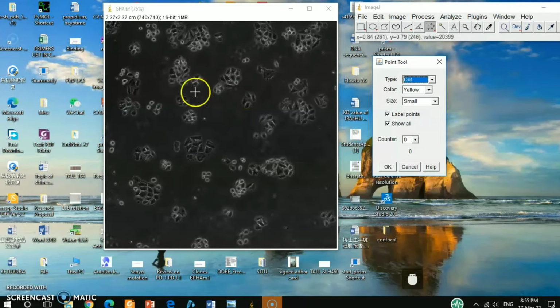In this case you can click one by one, like 1, 2. You can see the number is counting here: 2, 3, 4, 5, 6, 7, 8, 9, 10, 11.